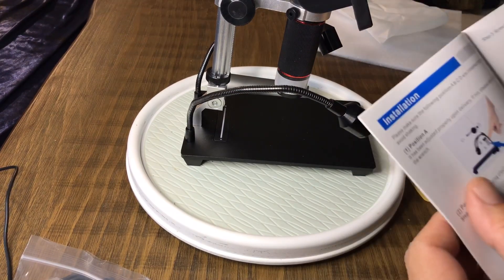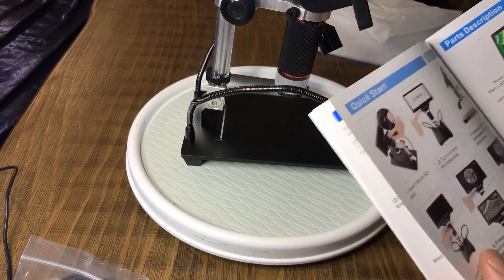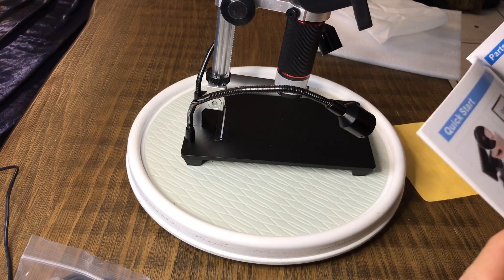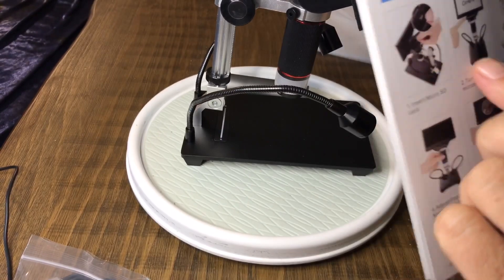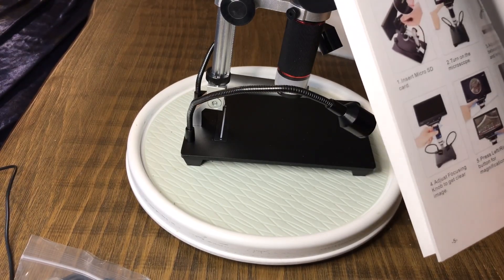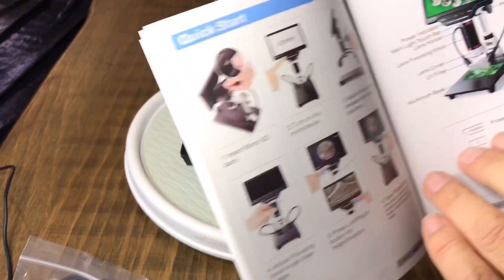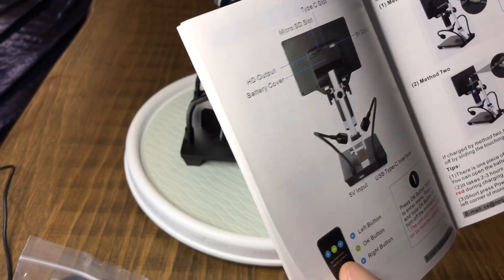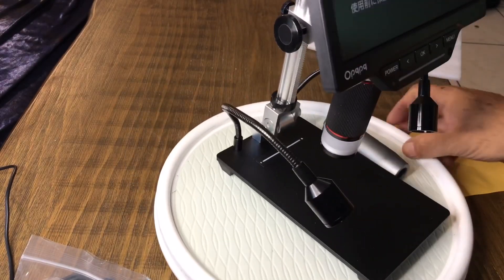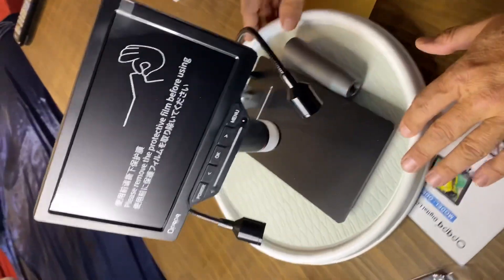Let's see installation — make sure that it's oriented correctly, rotate the black ring and lock that in place. Imagine how easy that is to put together; I didn't even really need the manual. It says something about inserting the SD card, which goes in the back. Turn on the microscope with the power button, adjust the distance, take a picture. I haven't figured out how the lights turn on yet. That is a nice-looking microscope from the side.